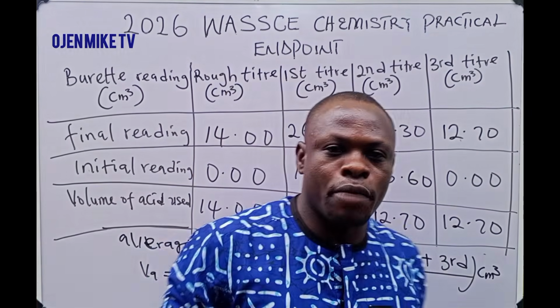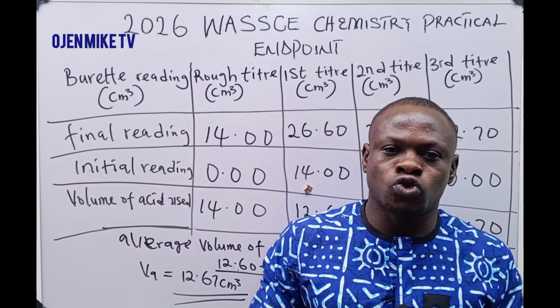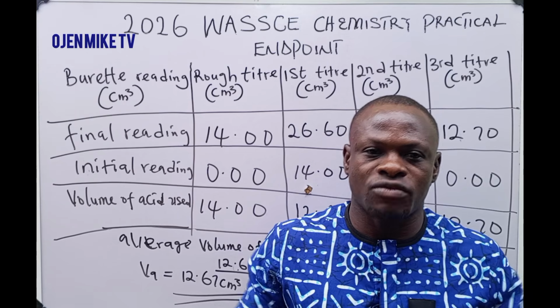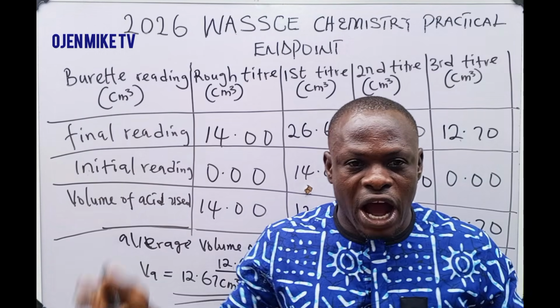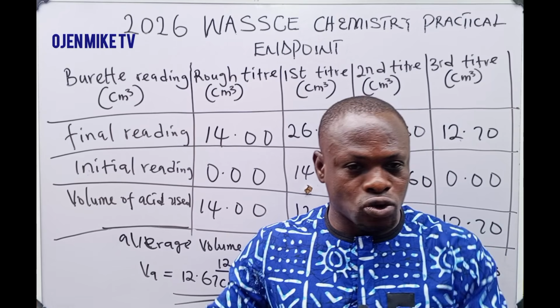You can use an endpoint of 11, or an endpoint of 12, that is 12.1, 12.2, 12.3, 12.4, 5, 6, 7, 8, 9, and then we have 13. 13.1, 13.2, until maybe you get to 13.7.